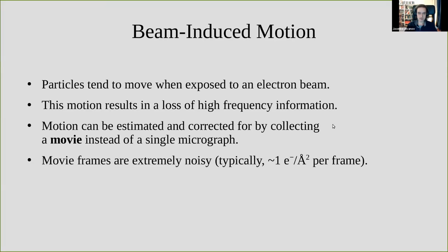Beam-induced motion is the effect that cryo-EM samples begin to move when they're illuminated by an electron beam. This produces blurry images if not accounted for, and those damage the high-frequency information in all the reconstructions we make from those images. For a long time, people have collected movies instead of single micrographs and then tried to align the frames of those movies to correct for this beam-induced motion.